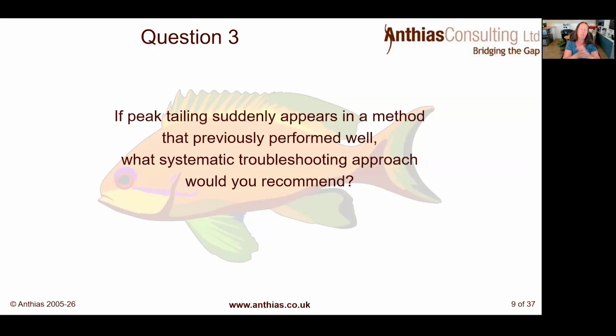So again, what I would first of all be asking is, what compounds are tailing? Is it everything? Is it just certain classes of compounds? So peak tailing can be caused by 2 problems, by activity, but also by dead volumes. So we want to know about the properties of those molecules.